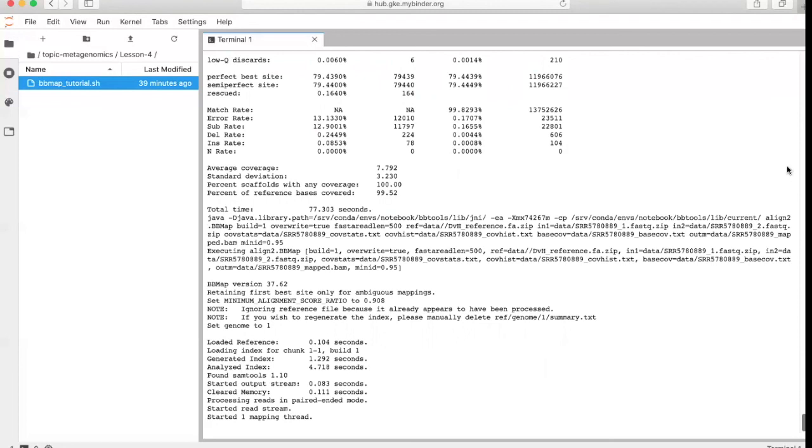And I can't fully understand it because it depends on so many different things, like the read quality and the scoring matrix. And I'm not supposed to understand how it works exactly, because it's an algorithm. It's not a simple addition. So that's fine. It's just, for me, easier to understand. And I think it's also easier for readers of your papers to understand what minimum ID is.